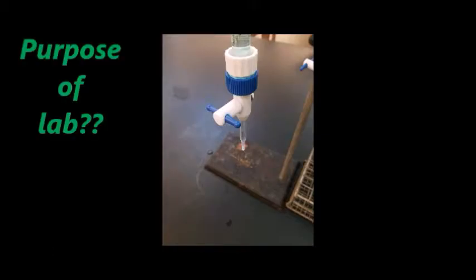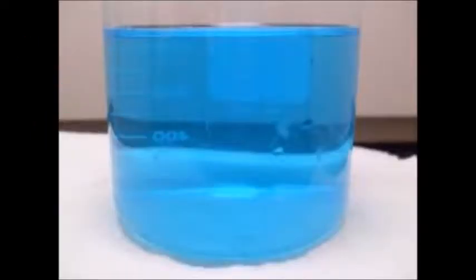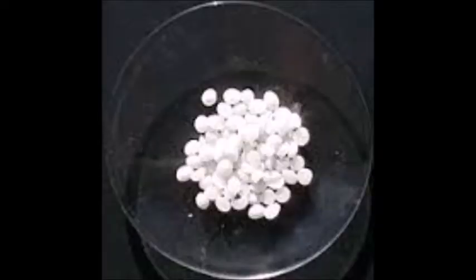Purpose: finding limiting reactants, discovered by the height of the precipitate formed by two solutions, 0.1 molar copper(II) sulfate and 0.2 molar potassium hydroxide. A limiting reactant is a reactant within a chemical reaction that will rule how much precipitate is produced by the chemical reaction. Limiting reactants can be simplified to daily events we oversee.